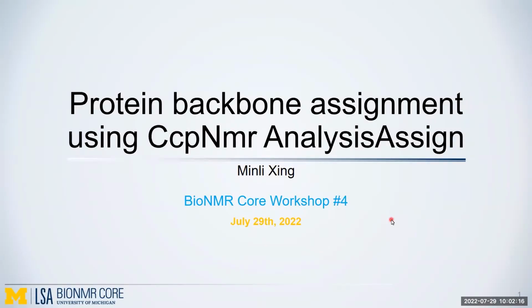Okay, so thank you for joining the fourth biomolecular NMR workshop. And our topic is protein backbone assignment using CCPNMR AnalysisAssign.